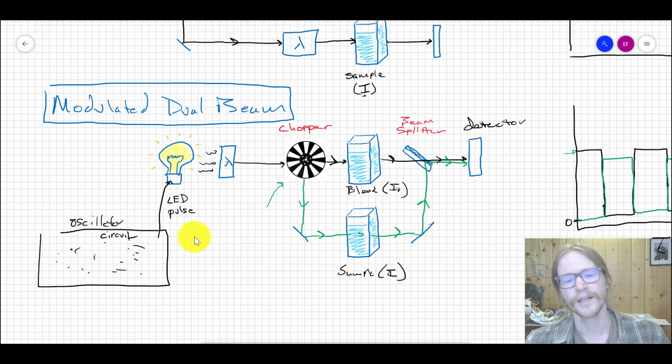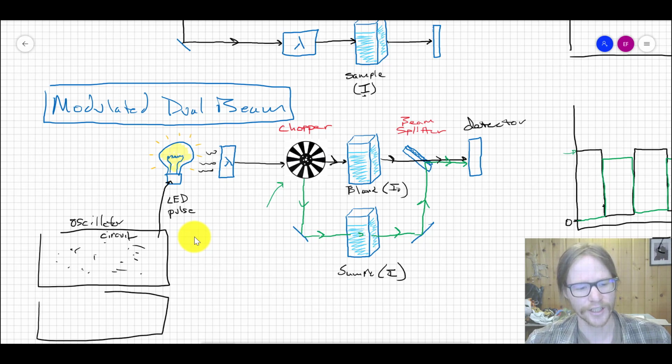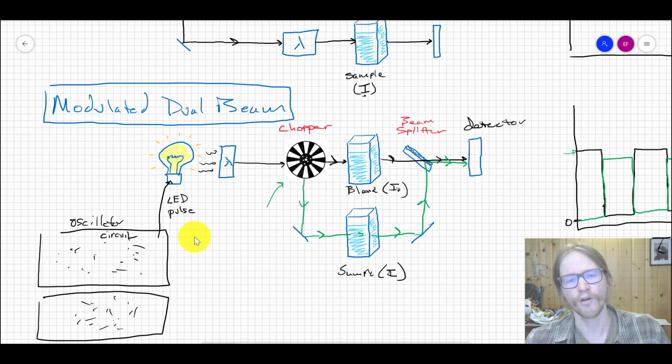It's pulsing. And then what else you do is you build onto this same breadboard, or another breadboard, your detection circuit. On that detection circuit you wire all this stuff up. That's what it looks like. And then you have the light hit this detector, which is a little photodiode, essentially the singular component that goes into a photovoltaic. It's made of a PN junction of silicon, and that just changes the overall voltage reading that you measure.